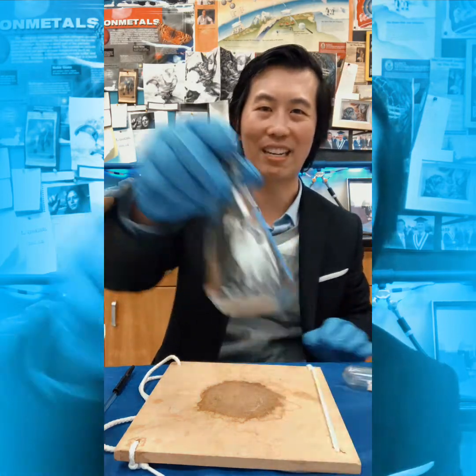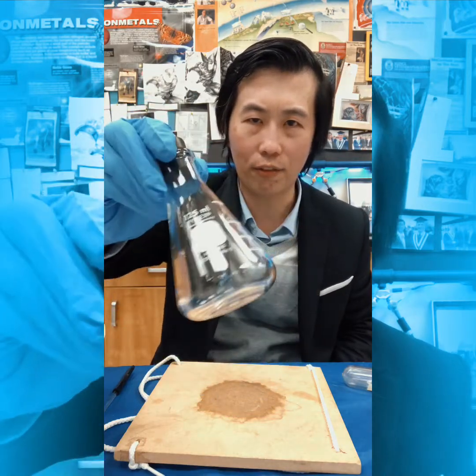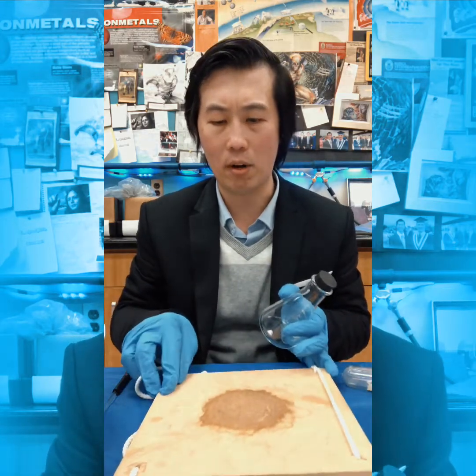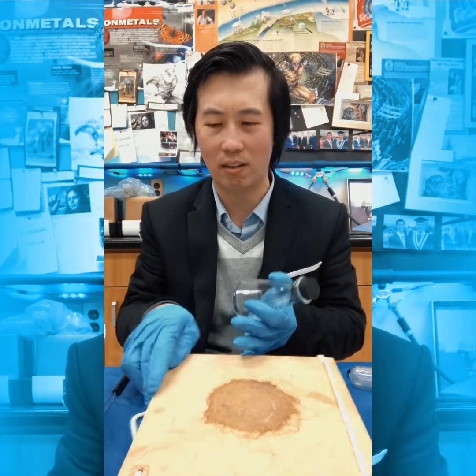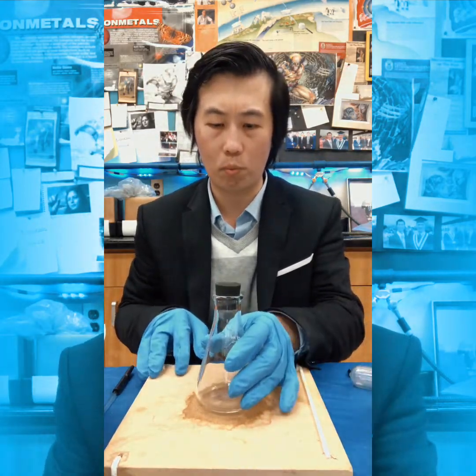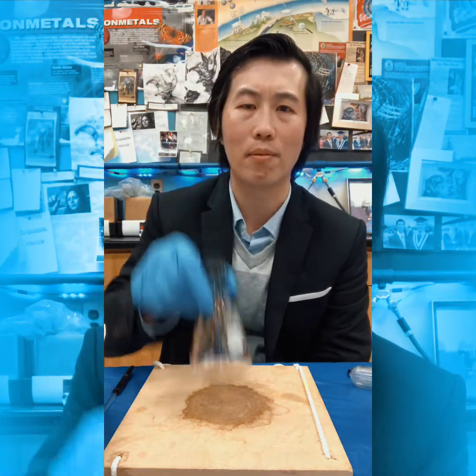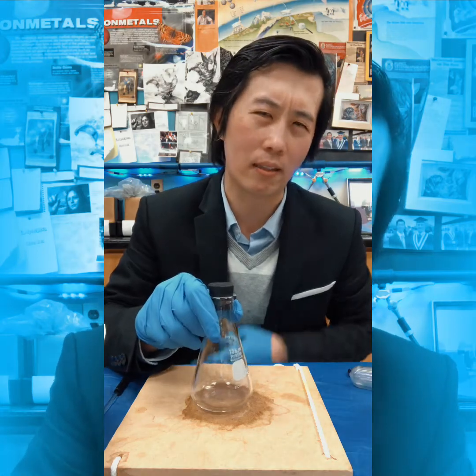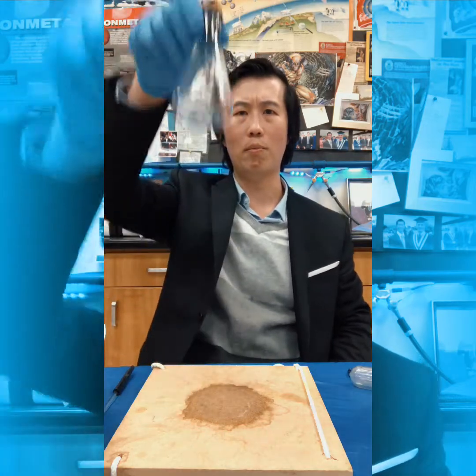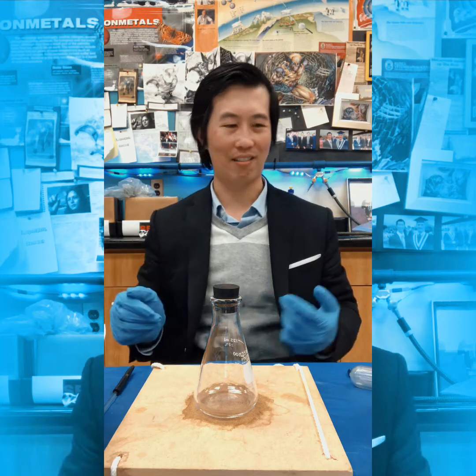I have right here a flask. And I got a particle board from the construction room. The basic science here is that by putting this flask on top of this construction particle board, it's unable to lift it up. So I want to find a way to get this to adhere or stick to the board, so that we would be able to raise this whole thing together. And I want to do that by mixing chemicals together, okay?